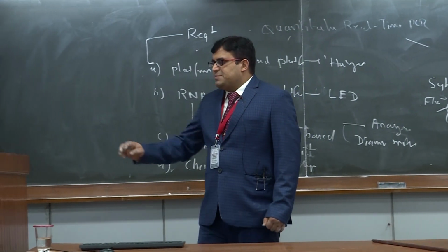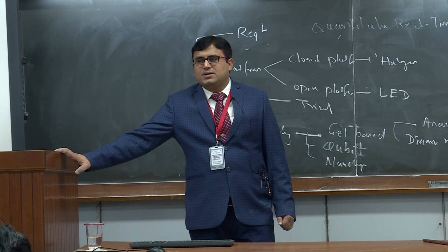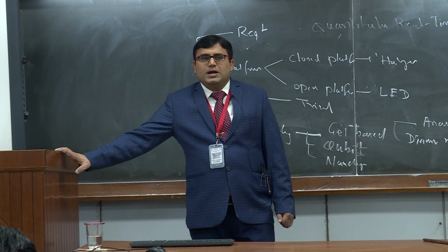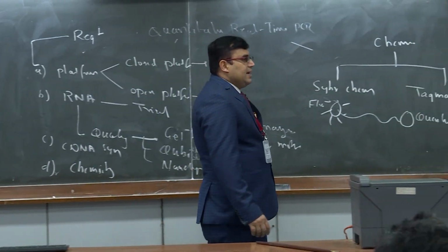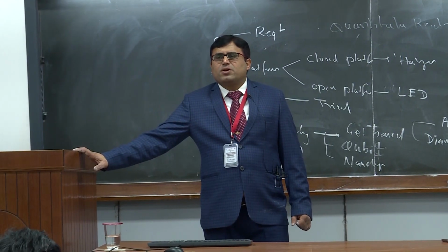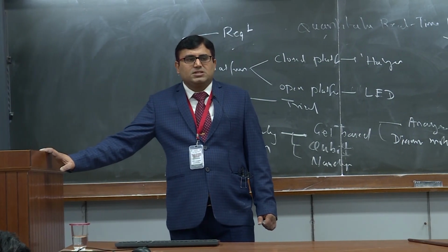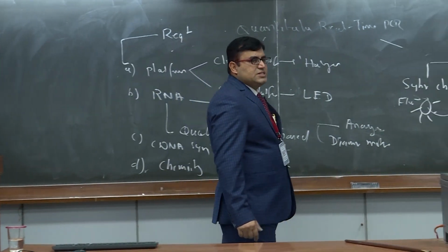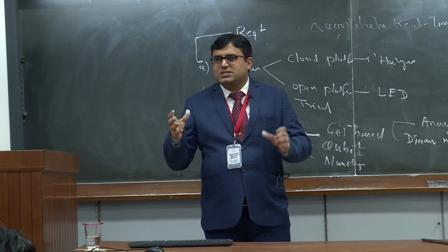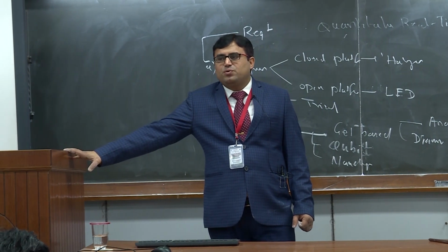Okay. SYBR-based chemistry, the cost per reaction is very low. It is user-friendly and cheap. TaqMan cost per reaction is very high as compared to SYBR. SYBR-based chemistry doesn't require much expertise. If anybody knows PCR, he or she can easily set up the reaction. In case of TaqMan, you require expertise to design the sequence, and then only you can execute, and it requires proper training. Then only you can go for TaqMan-based chemistry.